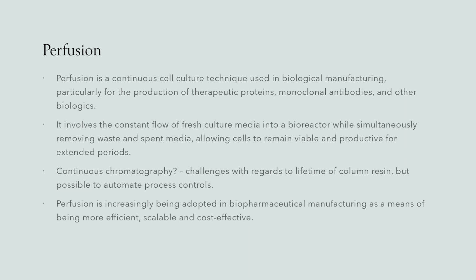So for example, you can look at continuous chromatography or chromatographic techniques, but you have to also take into consideration the challenges with regards to the lifetime of the column itself, because columns ultimately have a certain lifetime, and columns have to be equilibrated before they can actually be used for their required function. So there's all sorts of things you have to take into consideration. It's not sort of continuous and it just goes on forever.